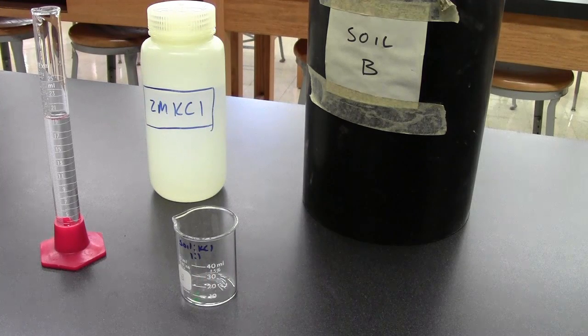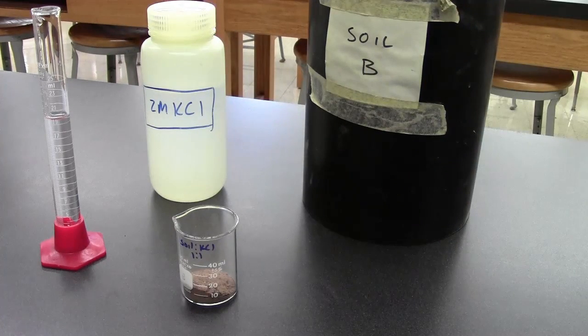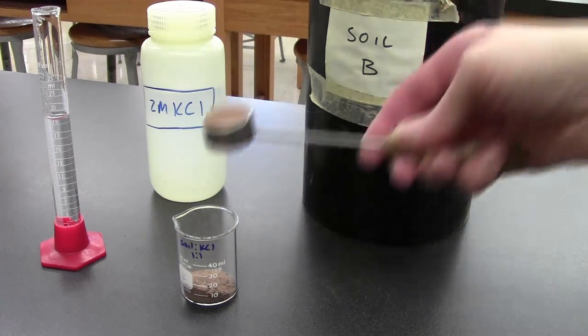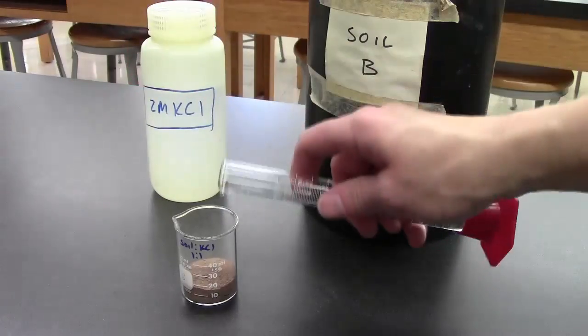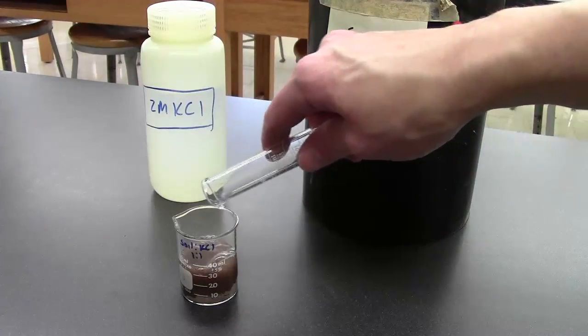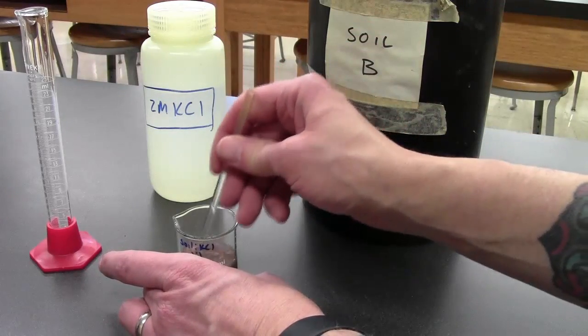To demonstrate salt-replaced acidity, we mix 1 part soil with 1 part 2 molar potassium chloride. 20 grams of soil goes into the beaker with 20 milliliters of potassium chloride. Again, we stir the solution and allow it to sit for 10 minutes.